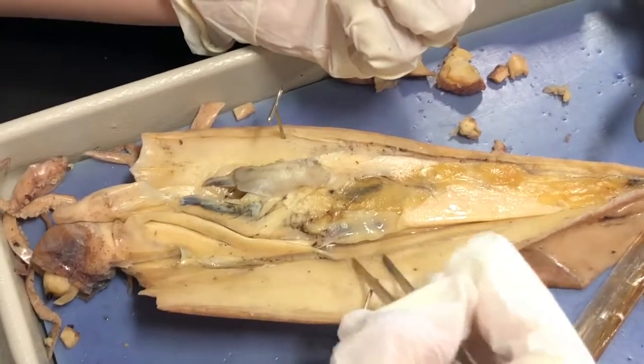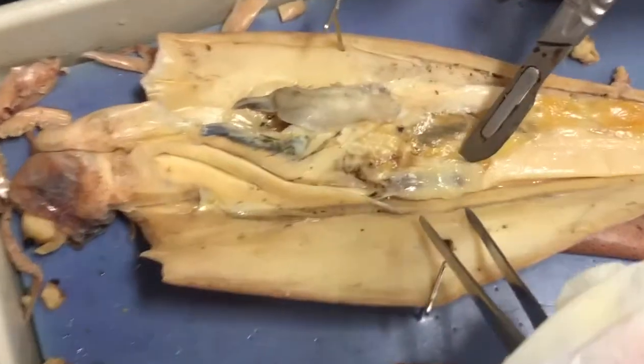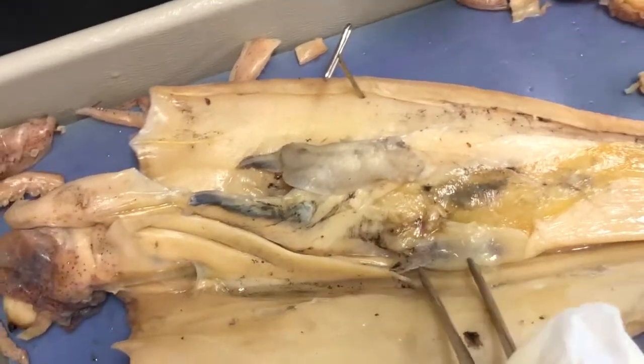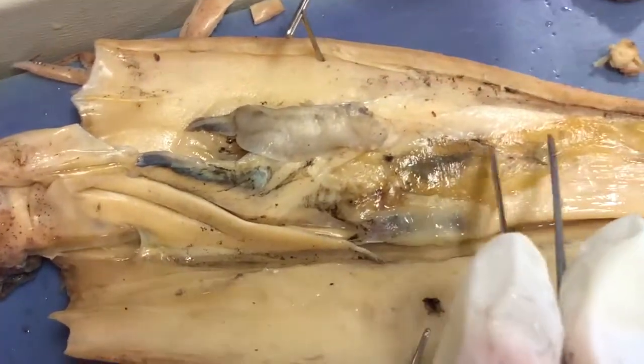There's 3 hearts, 1 systemic heart and 2 gill hearts. The gill hearts pump blood into the gills, and the systemic heart receives the oxygenated blood and sends it to the rest of the body.